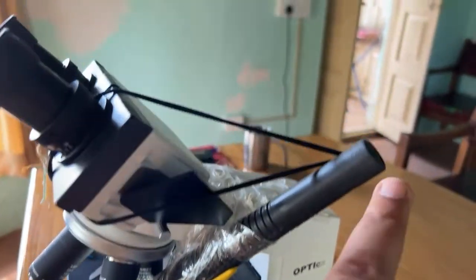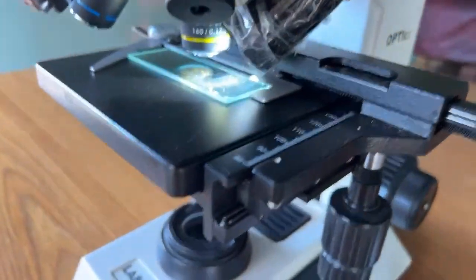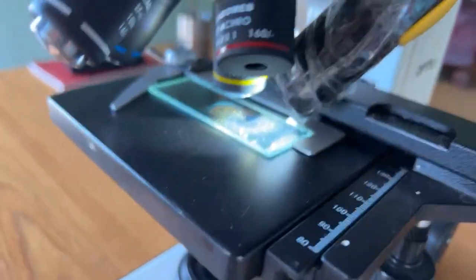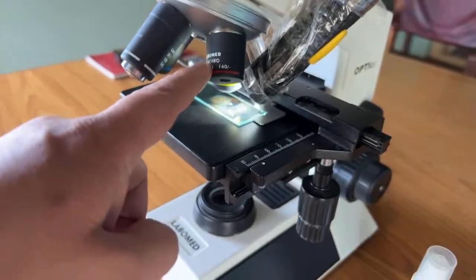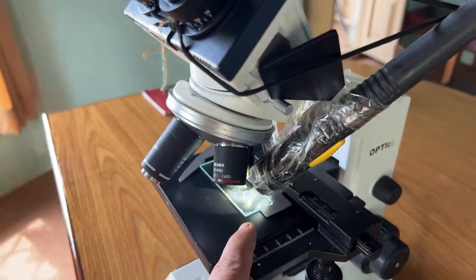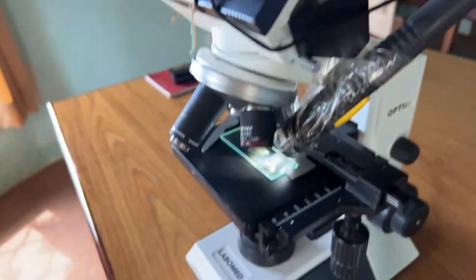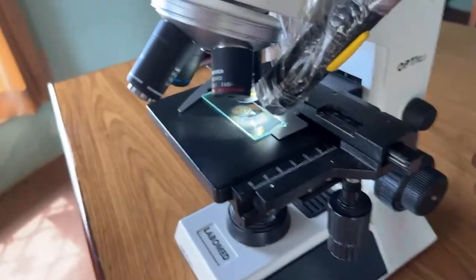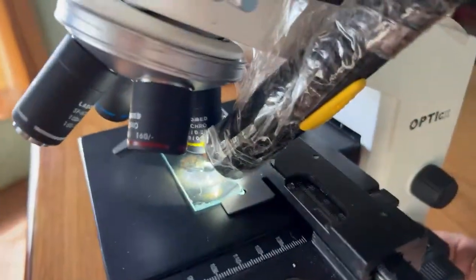What I have done is I've attached an LED torch, which is throwing light directly onto the slide. And what I'll see is the image caused by the reflected light. So it's not the light from this source coming through the sample like an X-ray, but a normal vision that we have, where the light falls on the object and is reflected back, and we shall be viewing it from this point. So rather than, where is the switch? Rather than this light, we shall be looking at this light.